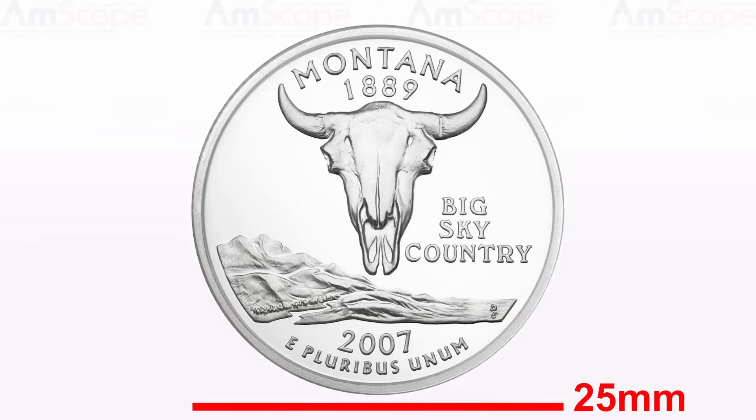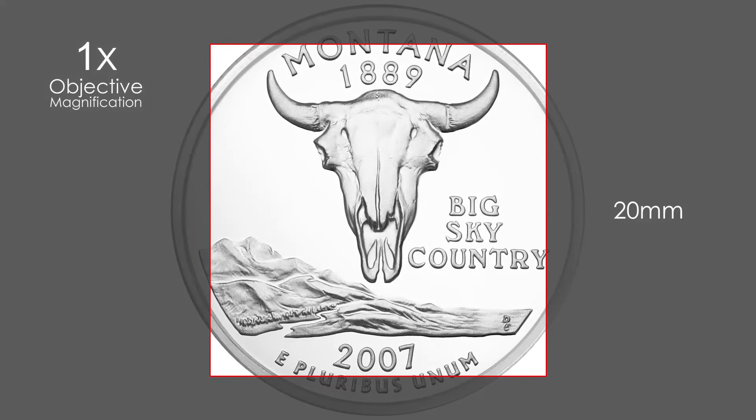This U.S. quarter is about 25 millimeters in diameter. With a field number of 20, at 1x magnification, the field of view is 20 millimeters, which shows most of the coin.